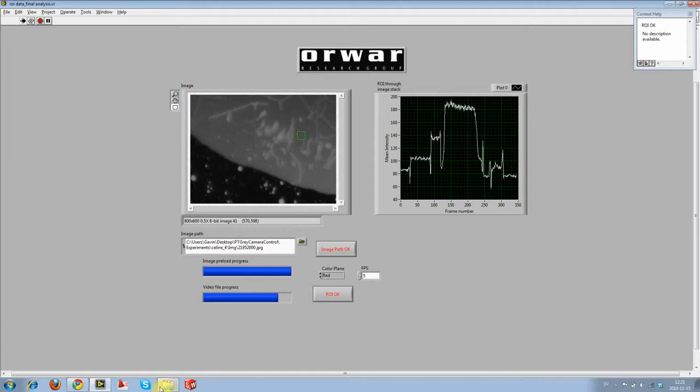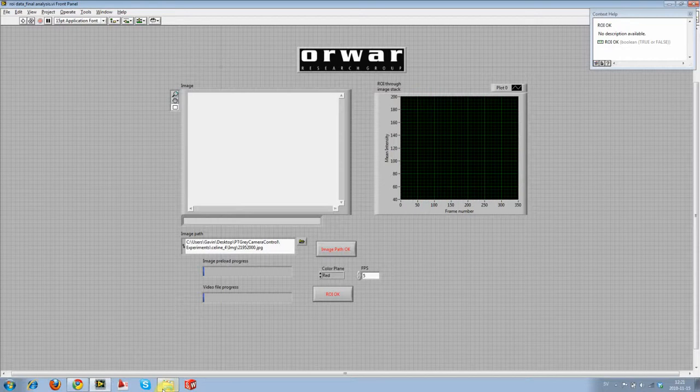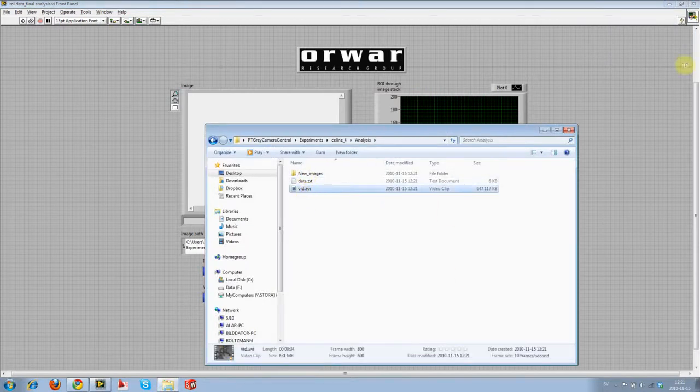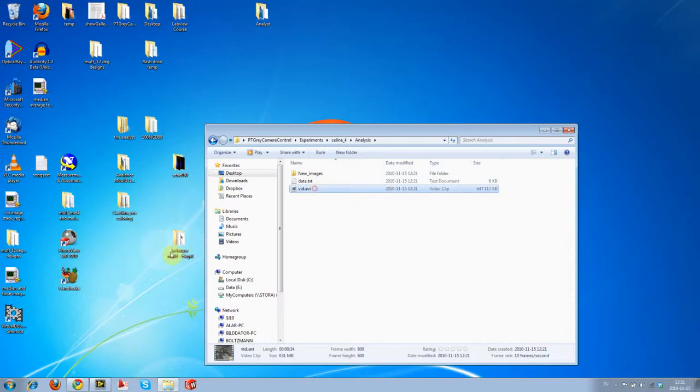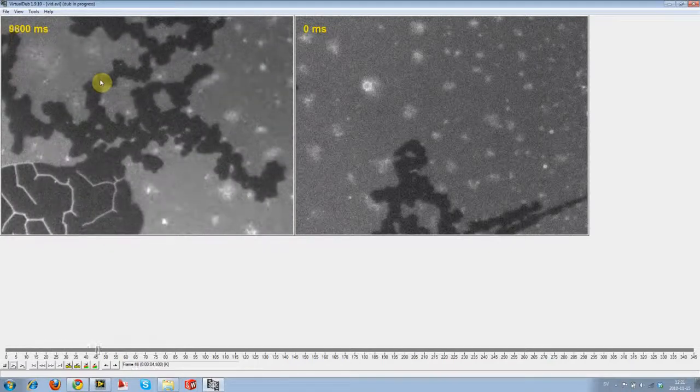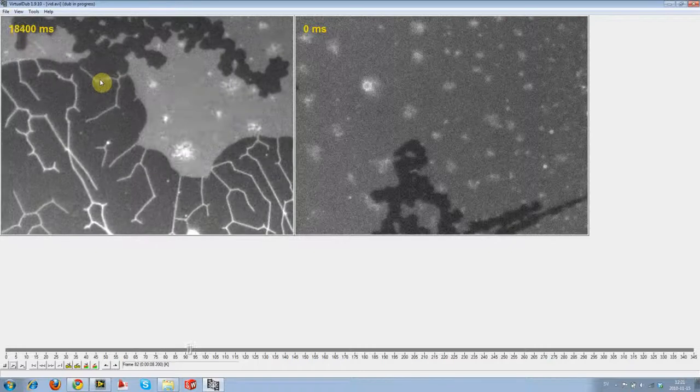Okay, and then once again this folder reappears. Everything else is as it was. Let's open this one. Video again. Okay, so that's much better. So we run it. We can see like we would normally see, but we now have this millisecond counter in the corner. And everything's customizable: position, size, color, etc. So there we have it.